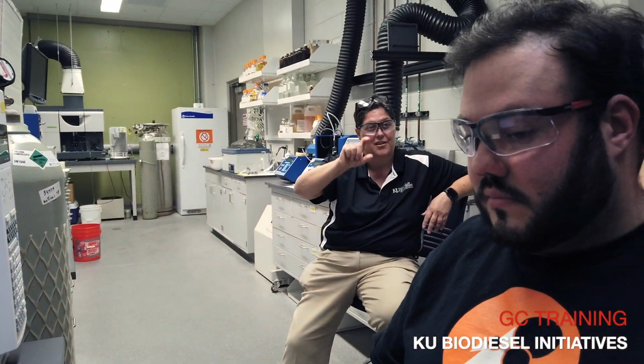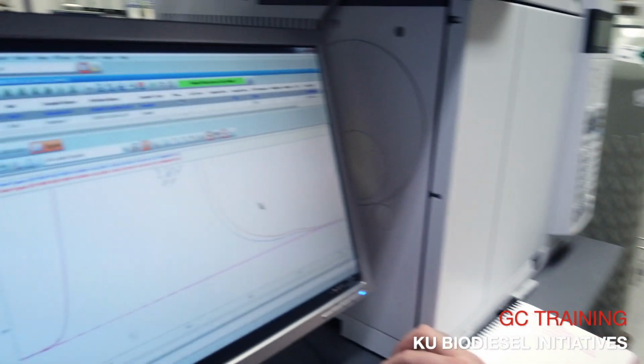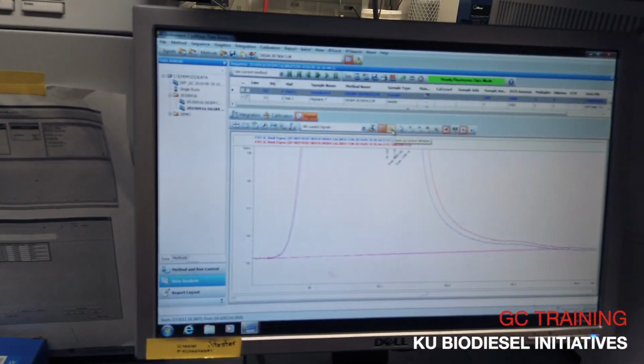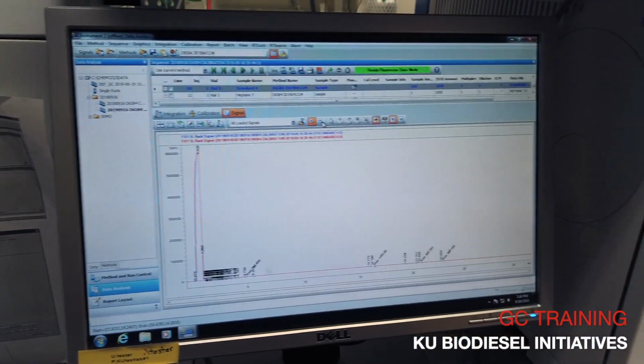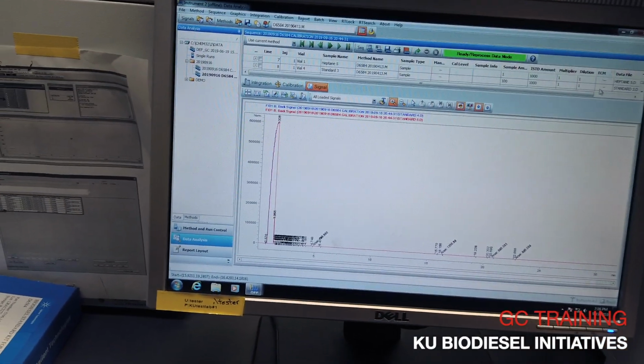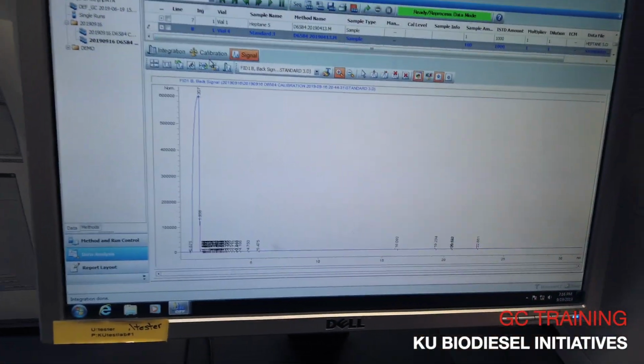You can see those peaks shrinking, and you're setting a calibration curve for that specific material in those different standards. If you're ever doing the calibration and you go to the overlay and one looks really weird with an outlier, don't use it in the calibration, because they should be successively smaller and pretty uniform in how they change.